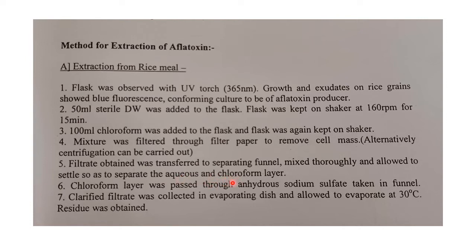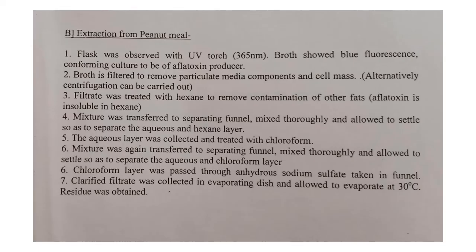That is, water and chloroform separate into layers. Now the chloroform layer was passed through anhydrous sodium sulfate taken in a funnel, and the clarified filtrate was collected in an evaporating dish and allowed to evaporate at 30 degrees Celsius, and then the residue was obtained. Okay, so now this residue is your aflatoxin.